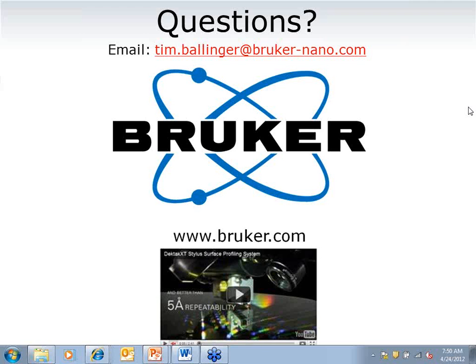So I think selecting filters that work for your particular application is something that only you can determine. We can provide some advice and give some experience of what has been done by other companies or other organizations or other customers or another application. But it's really up to you to determine what works best and stick with it because, again, anytime you change the filtering, it's going to change the measurement you collect.